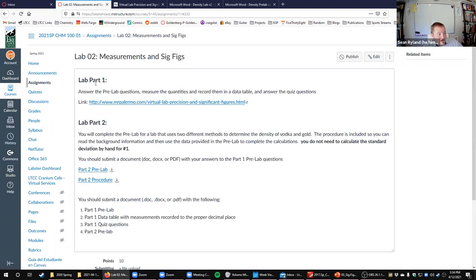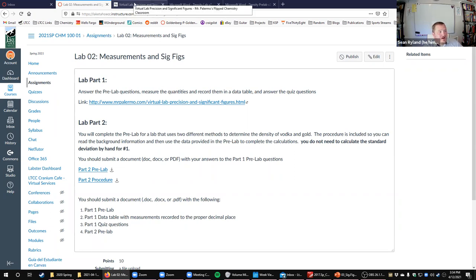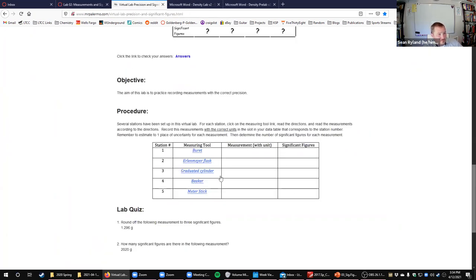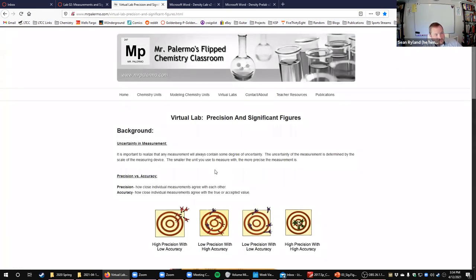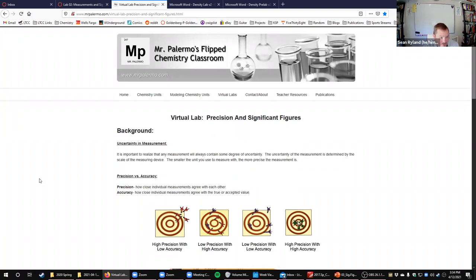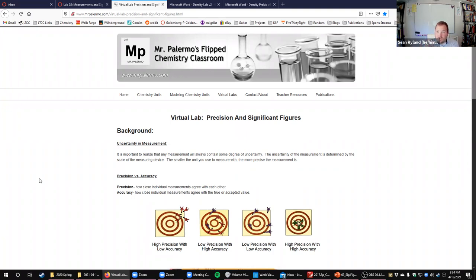Part one is this website made by a teacher from New York named Mr. Palermo who made this pretty good virtual lab about uncertainty. One of the key aspects here: remember, on uncertainty, what we're trying to do when we're writing down a measurement is write down the numbers you know with absolute certainty and then estimate one spot past that.